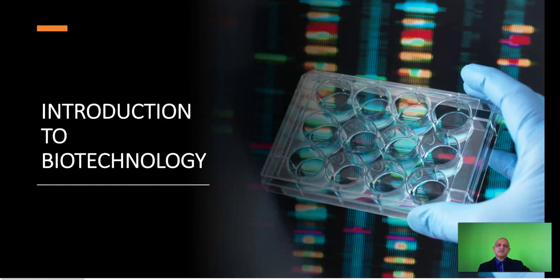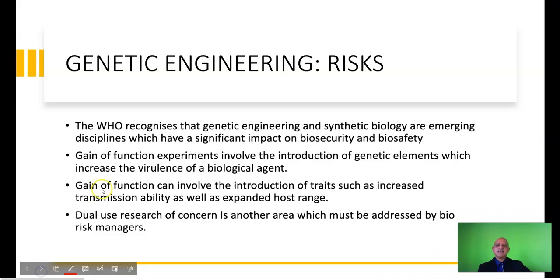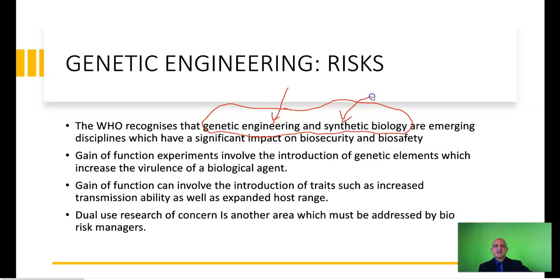We now move on to the next part, which is the introduction to biotechnology. Now, the World Health Organization has recognized the challenge faced by labs in terms of genetic engineering and synthetic biology. For those of us who are aware, genetic engineering involves the introduction of genes into a specific organism which are beyond the range of transmission of that organism.